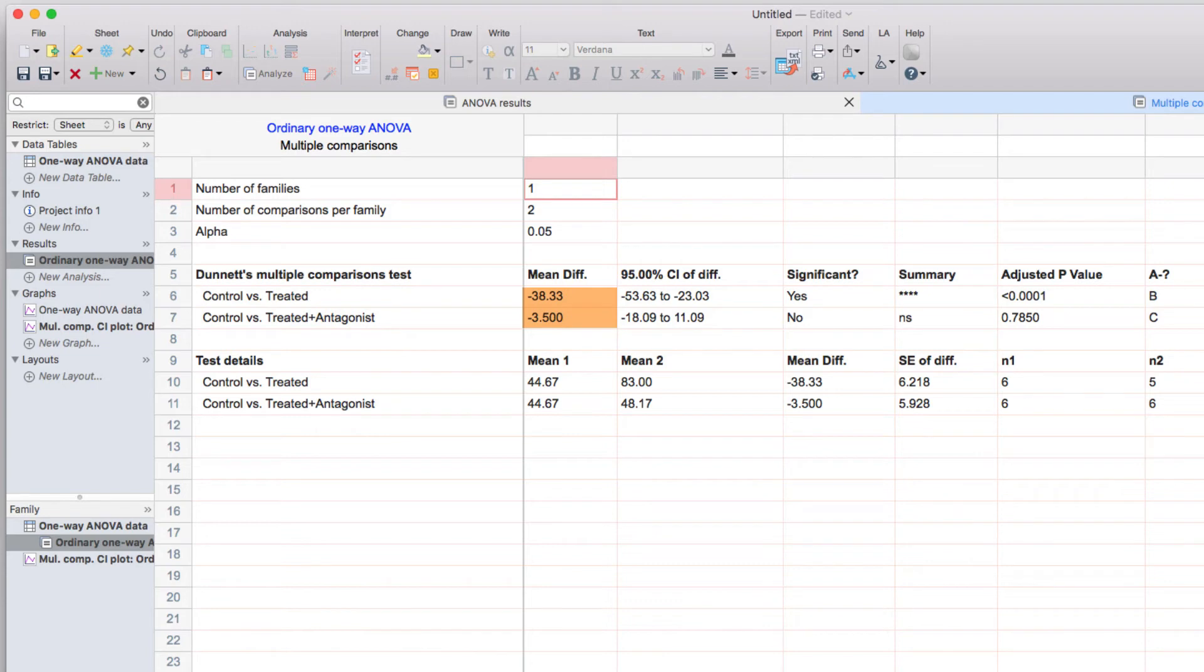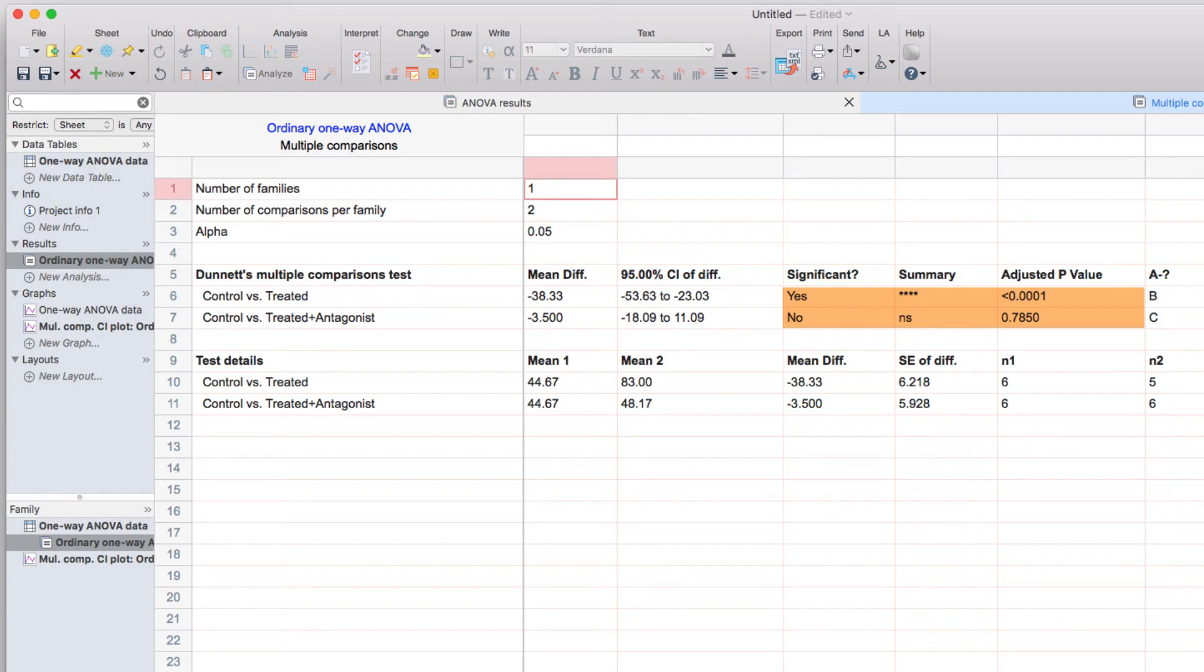information about their difference, the confidence interval, the difference, and also a summary of the statistical summary, including the calculated p-value.